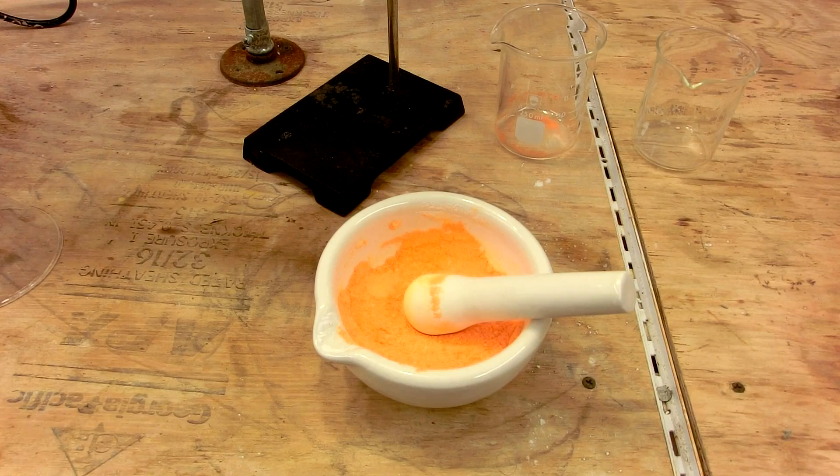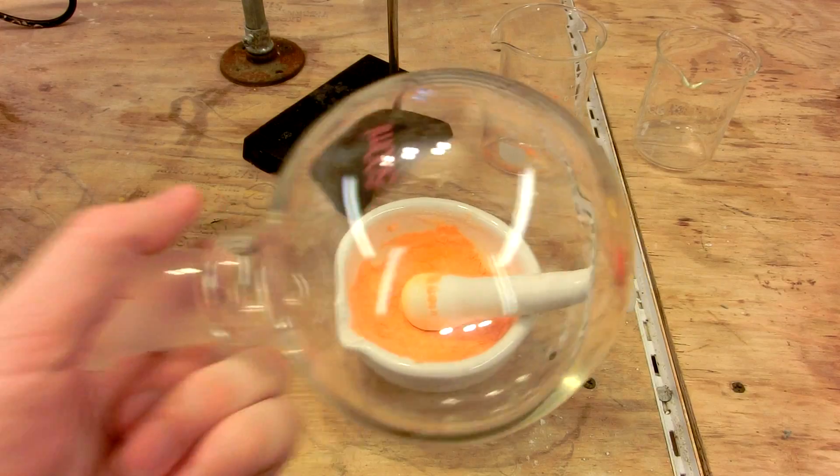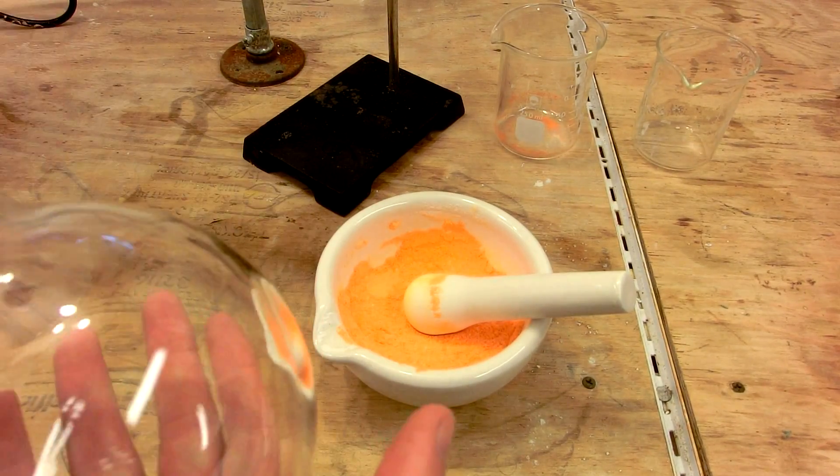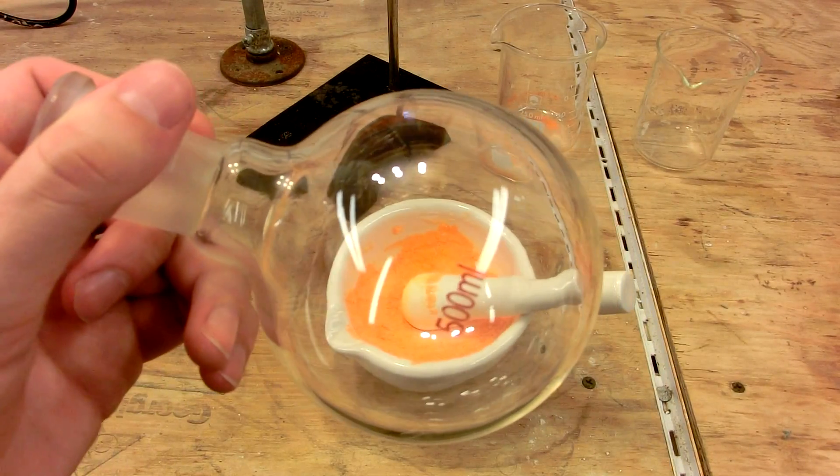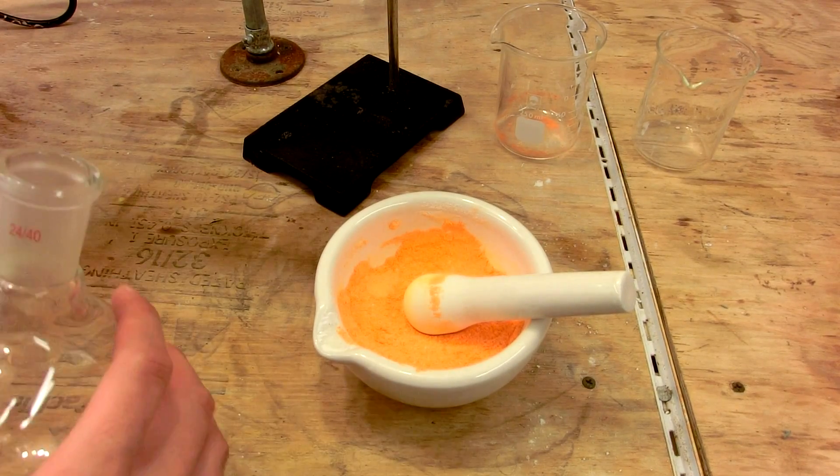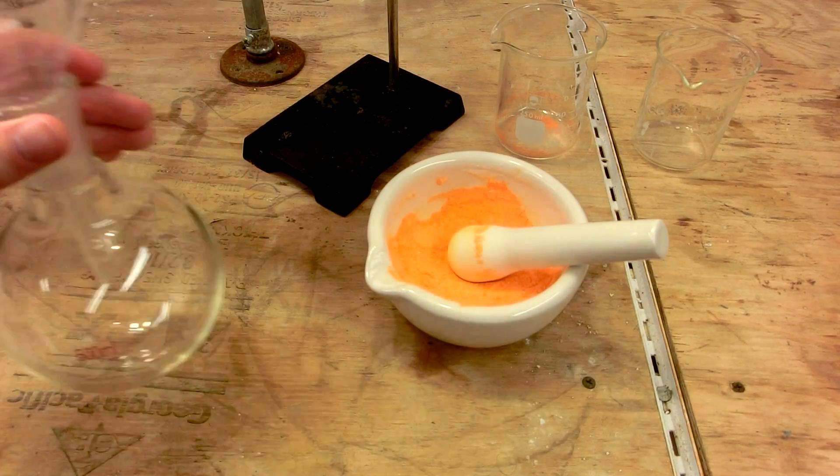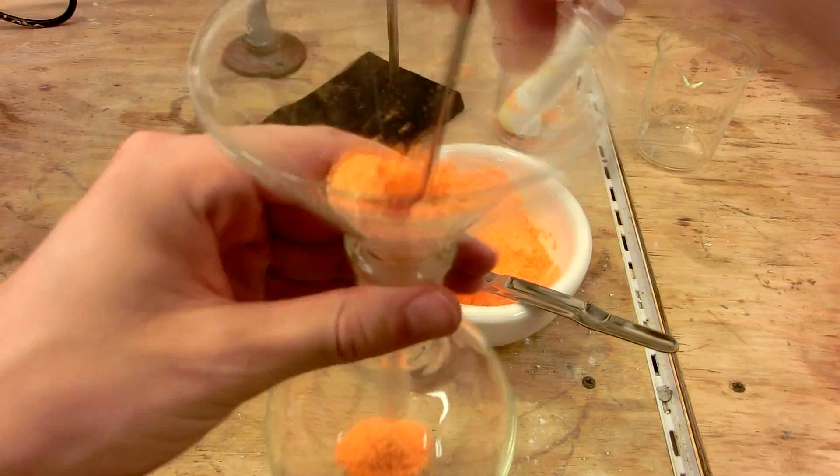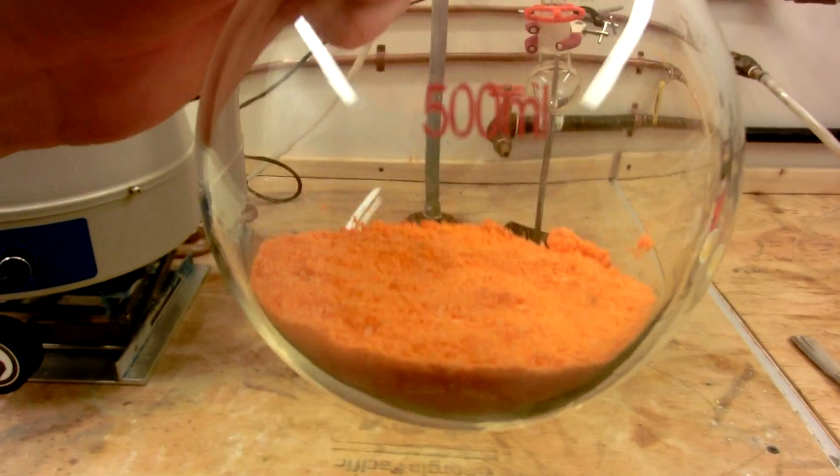When the reactants are fully homogenized, transfer them to a clean, dry, 500 milliliter round bottom flask that is free of organic contaminants. It's important that the whole setup is completely free of organic contaminants, because chromal chloride is a very strong oxidizer and reacts very violently with many organic compounds.